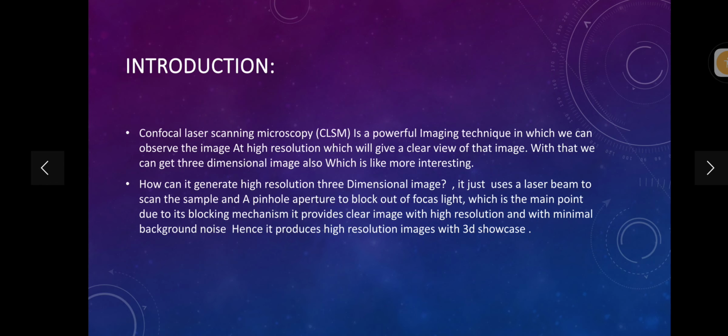And there arises a question: how can it generate a high resolution three-dimensional image? How could it? And how is it different from other microscopes? It uses just two components, a laser beam and a pinhole aperture. First one, the laser beam will just scan the sample.